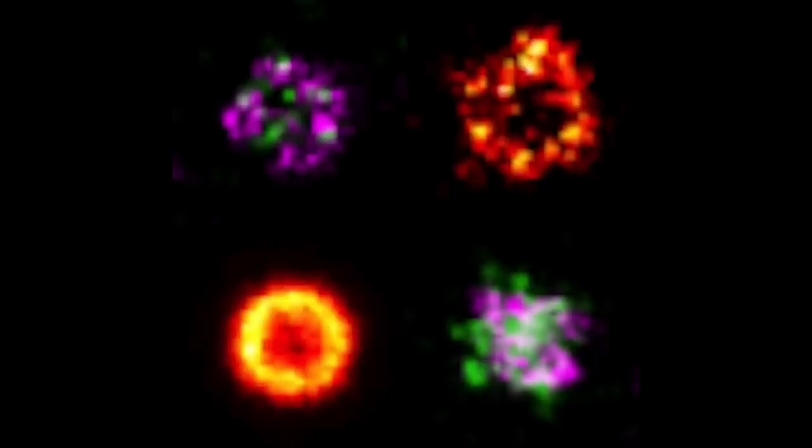Until about 10 years ago, it was not possible to see things that are smaller than a wavelength of light. Recently, a whole new class of so-called optical super-resolution microscopy techniques have become available, for which the Nobel Prize in Chemistry was awarded, and they permit us now to look at much greater detail inside living systems so we can see really what the molecular mechanisms are behind burning biological questions.